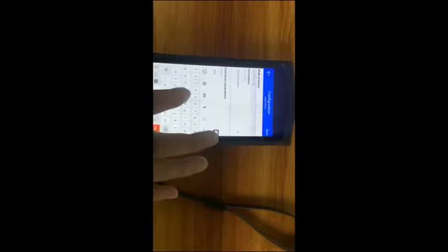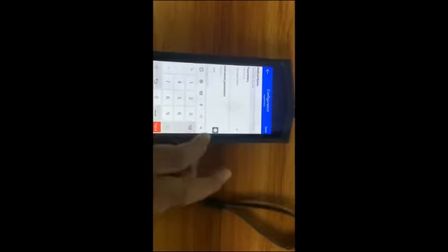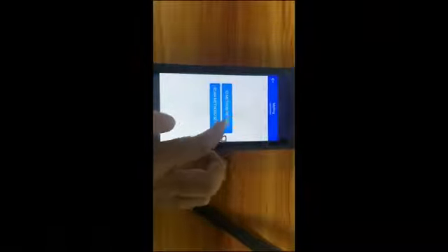Power on the laser power meter, and you can select the laser power and click dictate, and you can read out the laser power, which is 74.5.